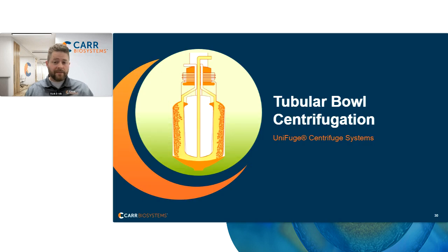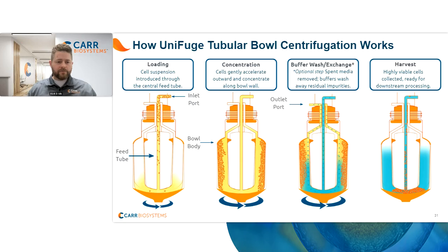Now, diving into tubular bowl centrifugation. Before I get too far into looking at this as a technology, I want to share a little bit about how it works today. So we start on the left here. We have our inlet port where the cells can be fed in on the center line of the bowl. As they get introduced in the feed tube, they get fed into the bowl body, which is rotating.